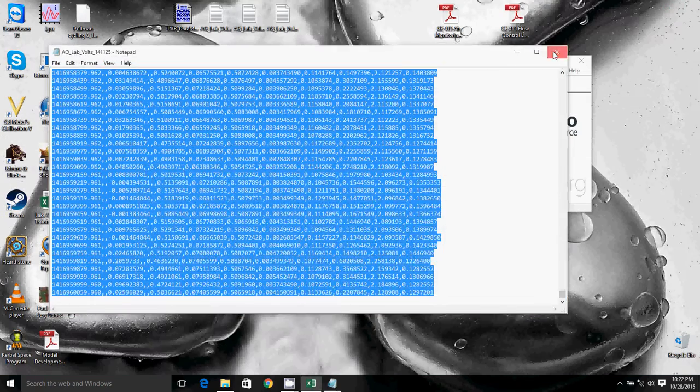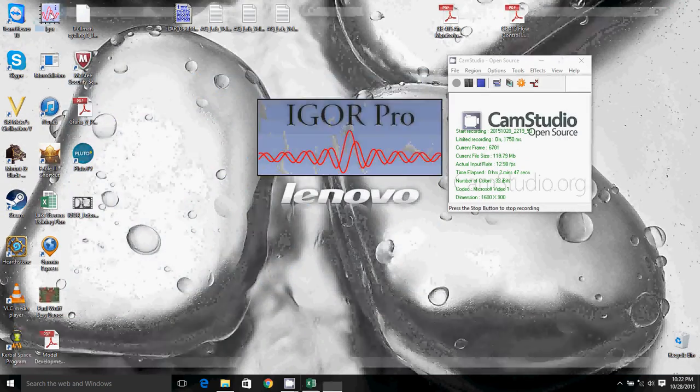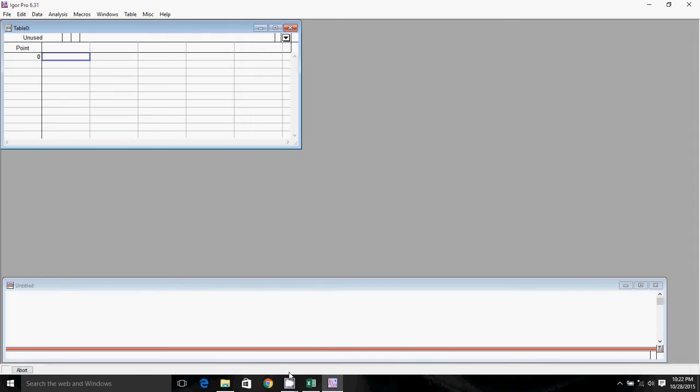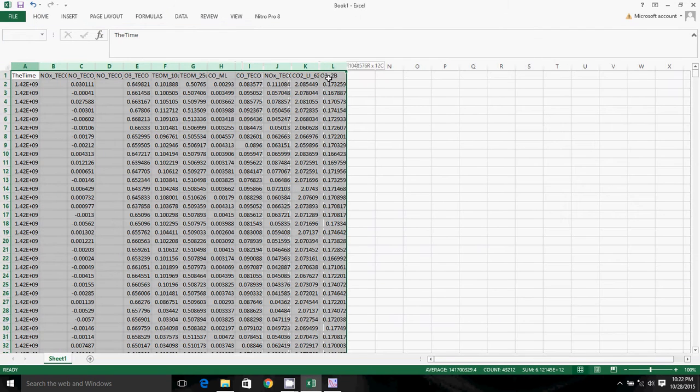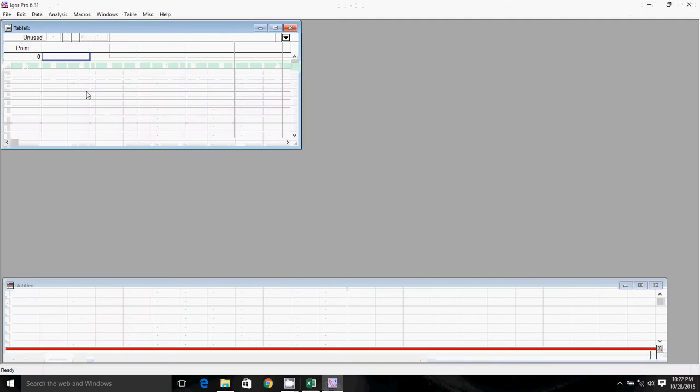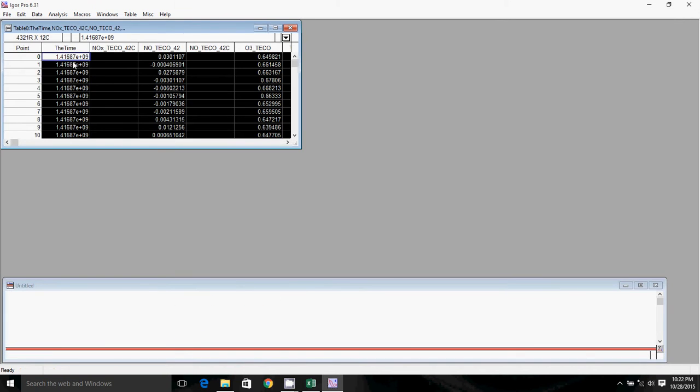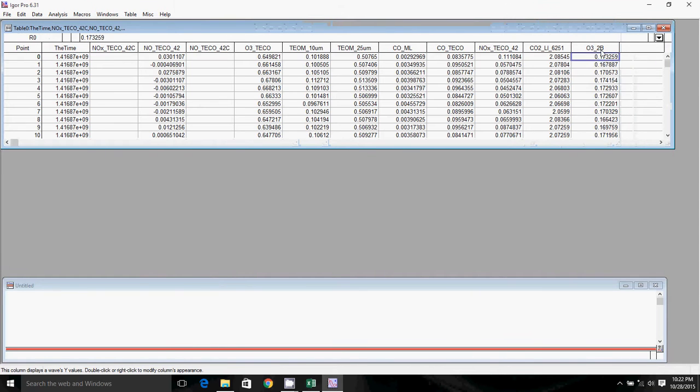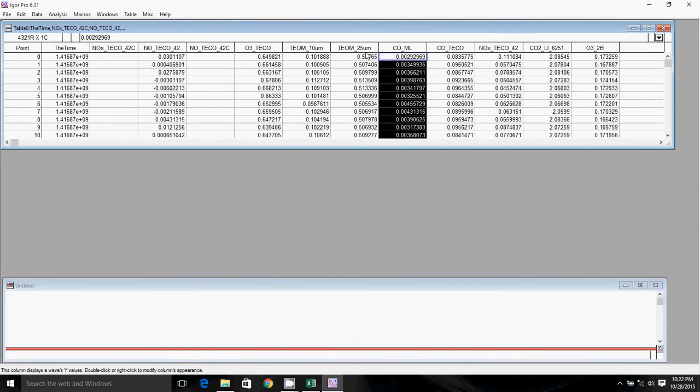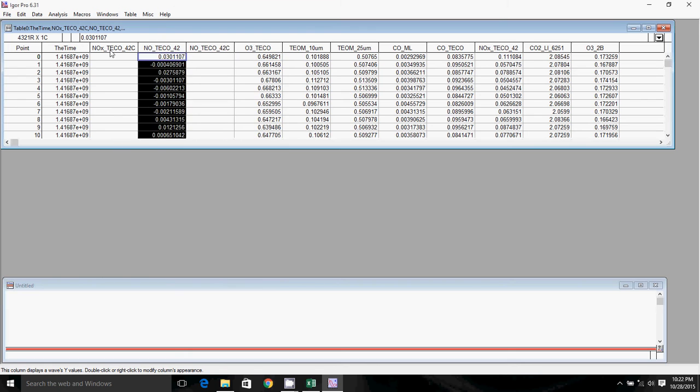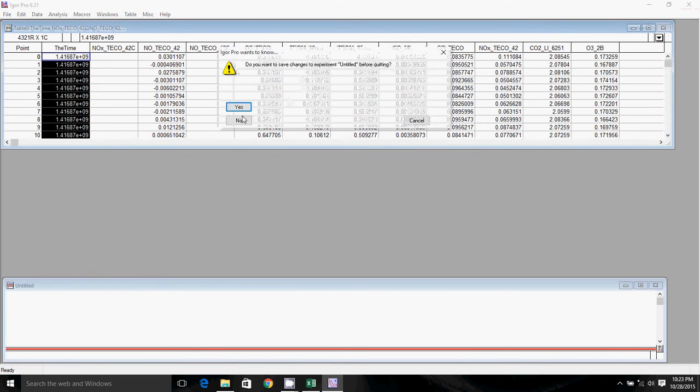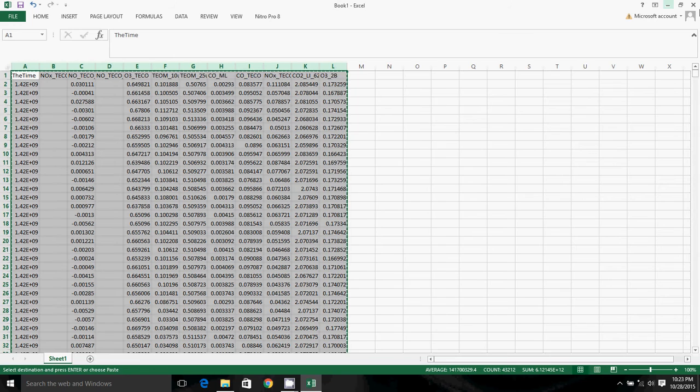We can close out all of these files, open Igor, then we'll just select all of these columns, we'll hit Control C to copy them, and then we'll click Control V to paste all of our data into Igor. And there you have it, you have discrete waves for each of your different pieces of data, all in Igor. So that's how you get data into Igor using Excel.